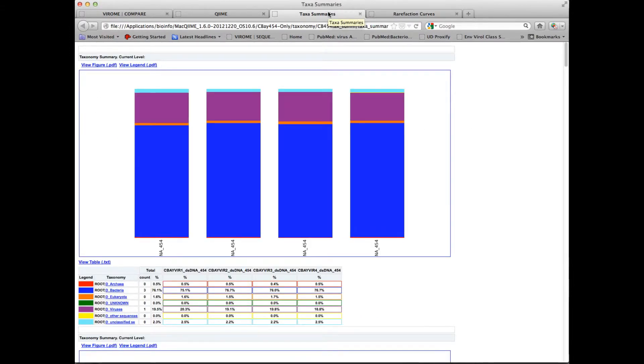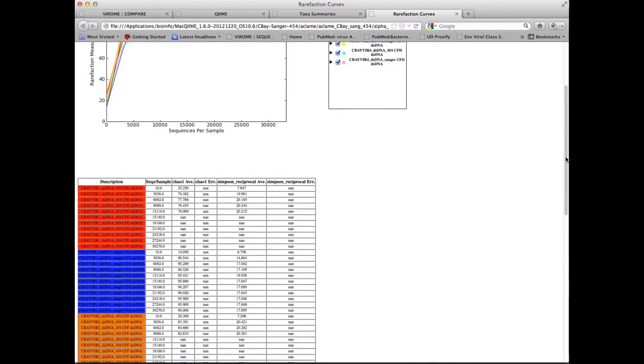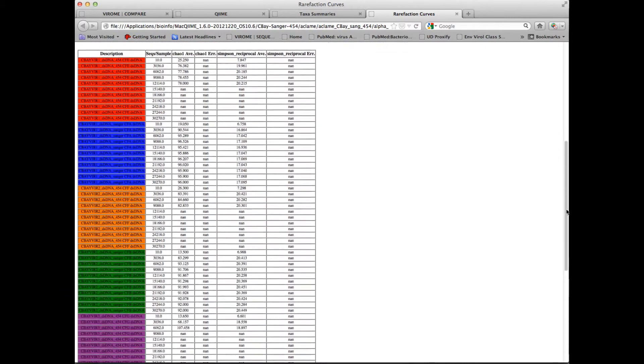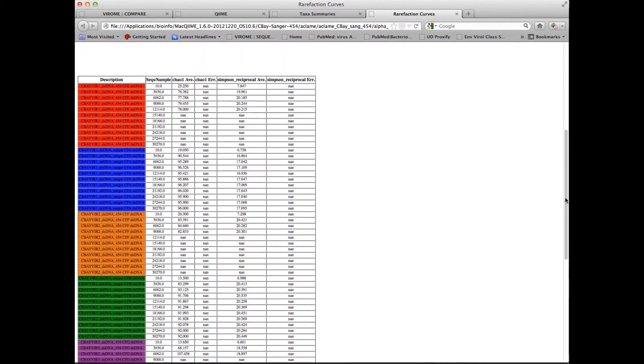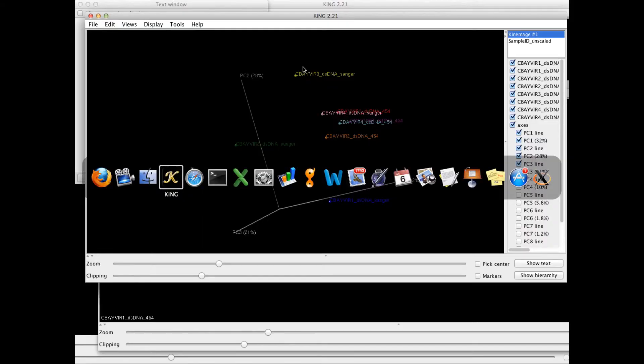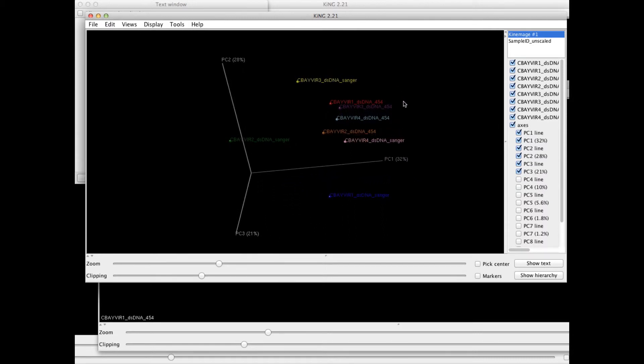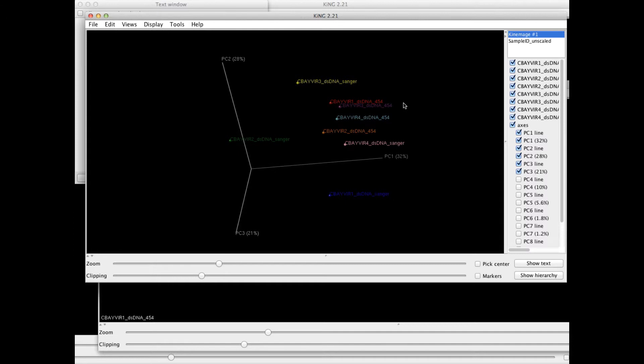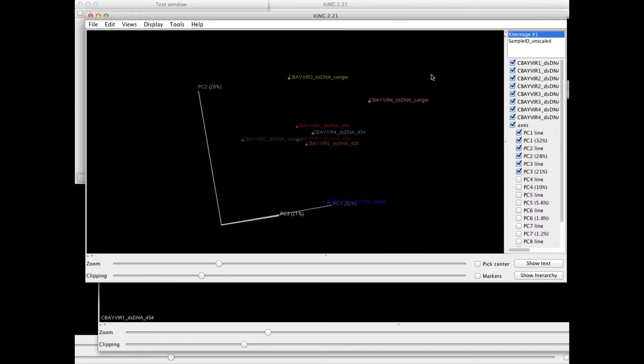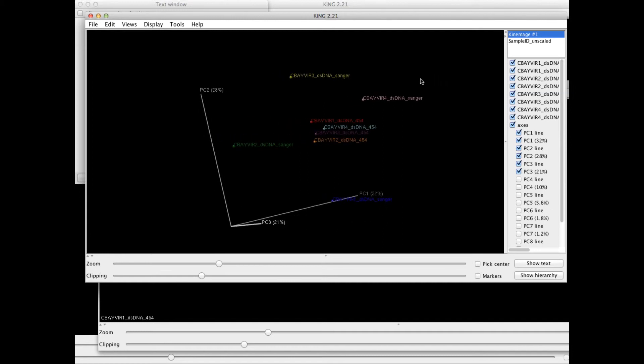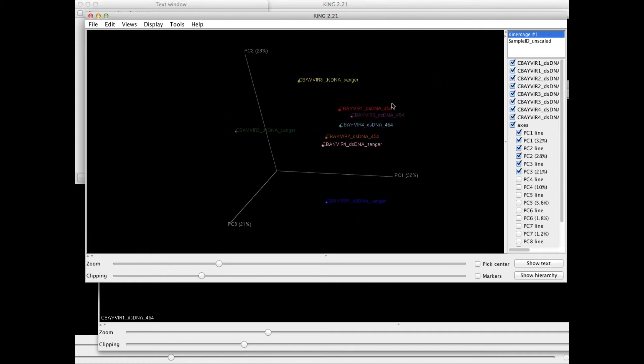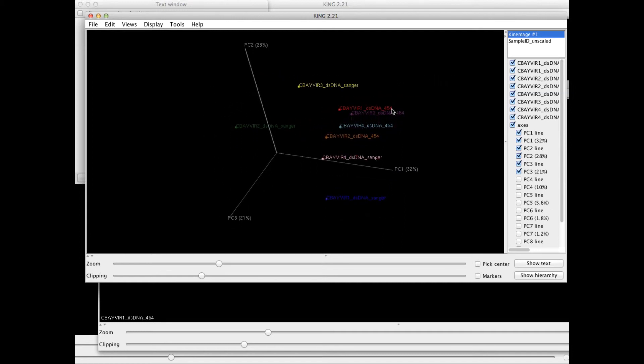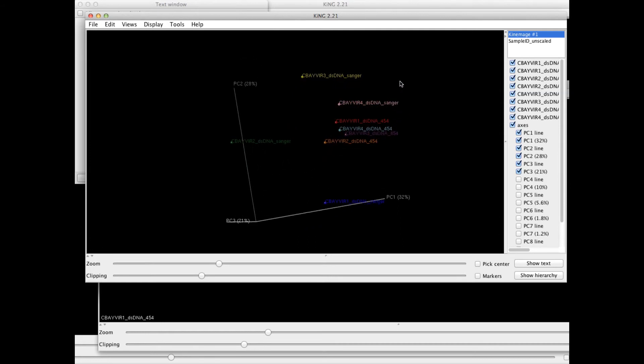Other example outputs from the CHIME package are rarefaction curves, which I show here, generated again from a Viroome biome file. This is an output of the alpha diversity pipeline. Or alternatively, you can run the beta diversity pipeline and compare libraries in principal component analysis, which I show here in the KING viewer, where you can see the position of libraries relative to one another, according to taxonomic distribution of hits.